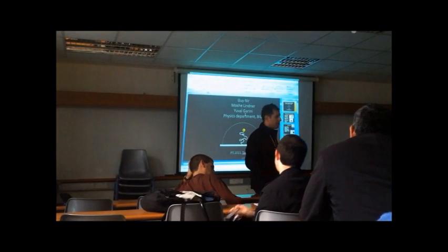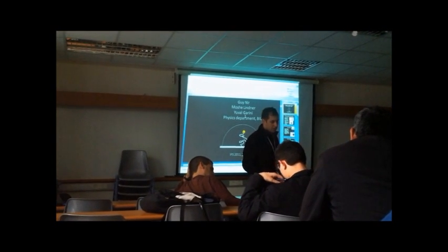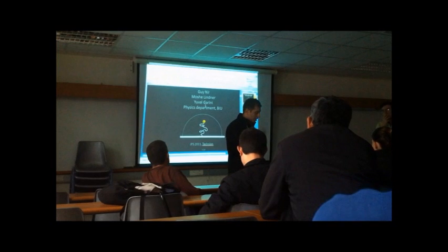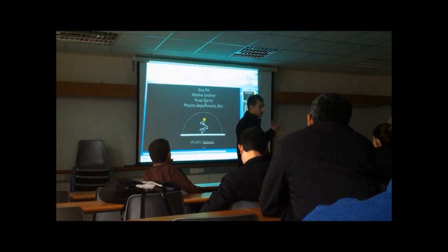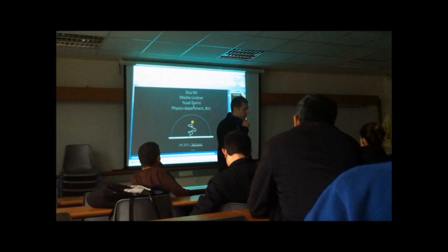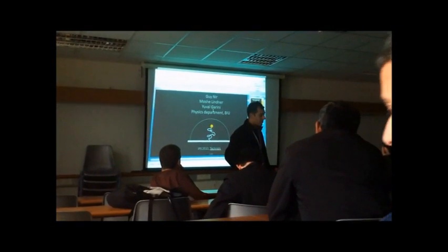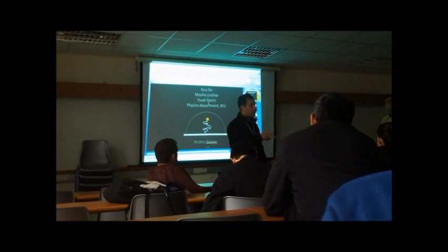I didn't check. I can't check this. I mean, I don't think so. I don't think that it should be tethered or linked to absorb to the protein, because the other phenomenon is it could also be absorbed to the surface. I didn't check it, but I don't think it's actually the case, because otherwise there would be some unspecific binding to the gold nanobead, and you would actually see fluctuations in the intensity. So I would doubt it.